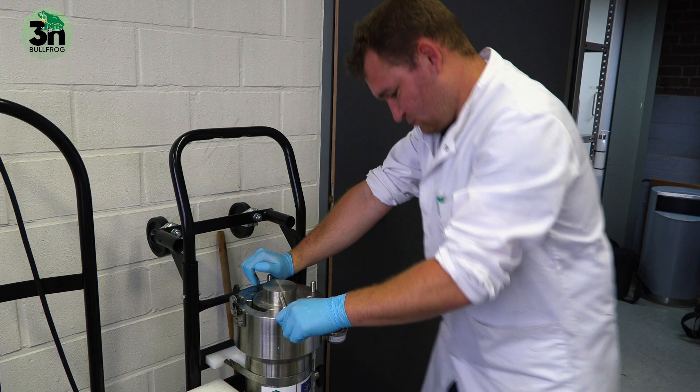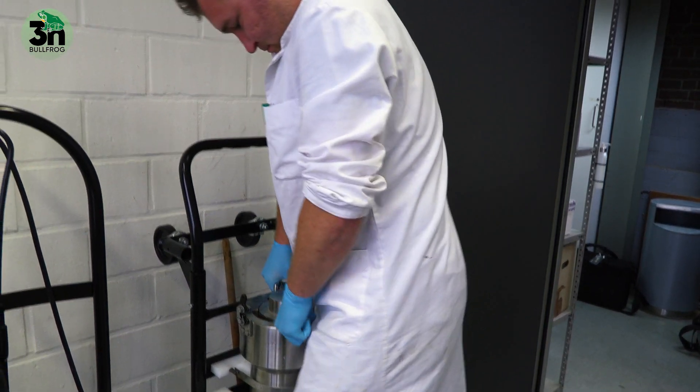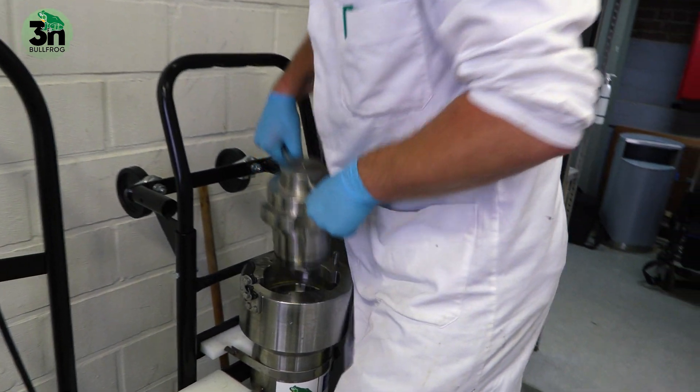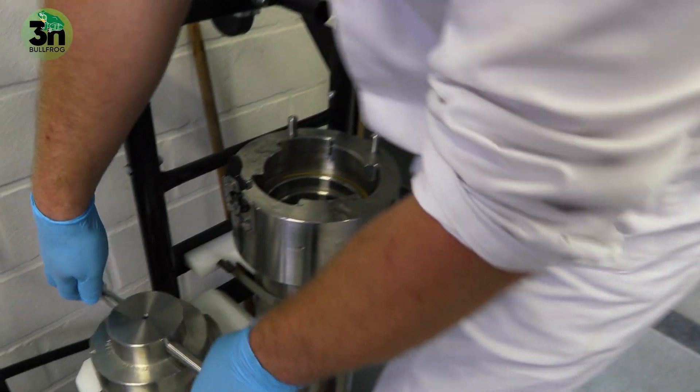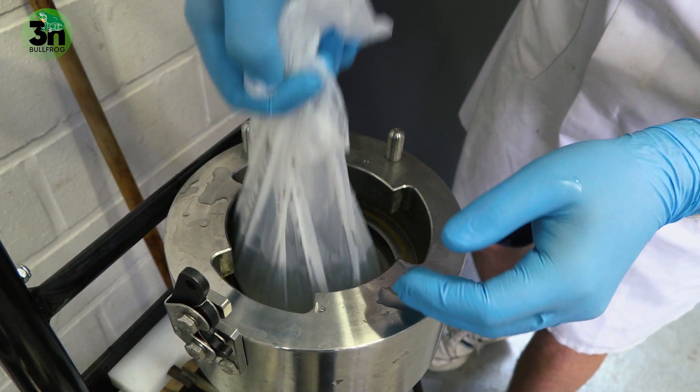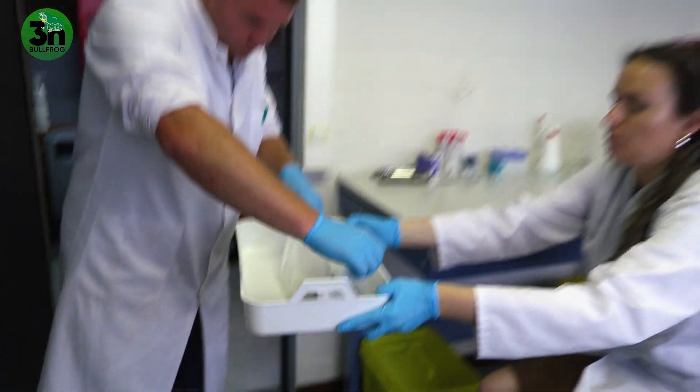The pressure of 5000 PSI lasts 6 minutes and then we retrieve the eggs from the capsule. Once this process is done, we retrieve the eggs from the pressure vessel and we put them in a biological recirculation system at 22 degrees Celsius.